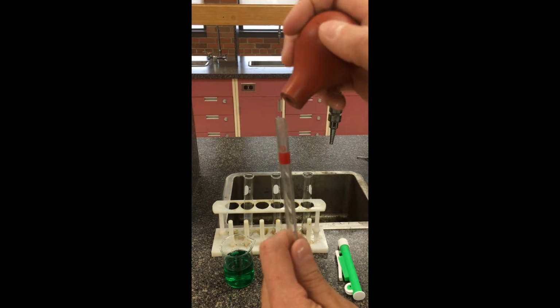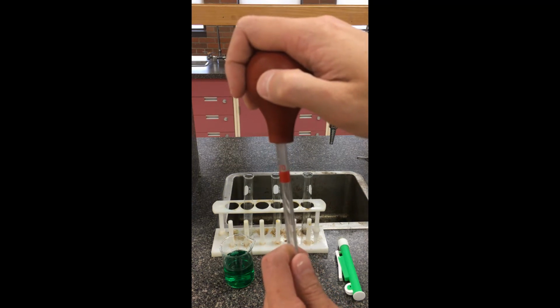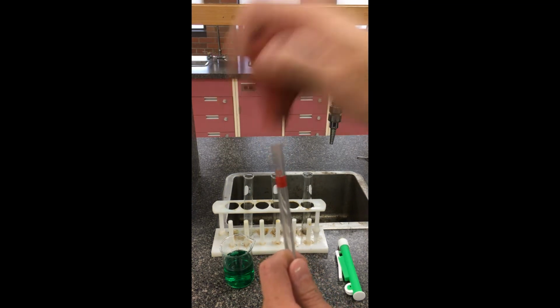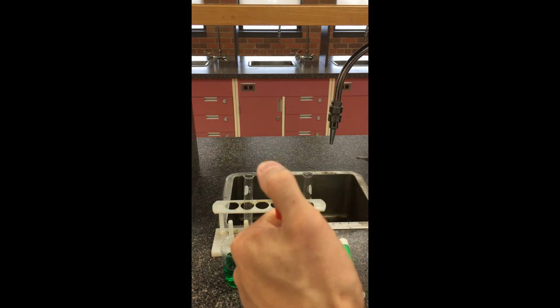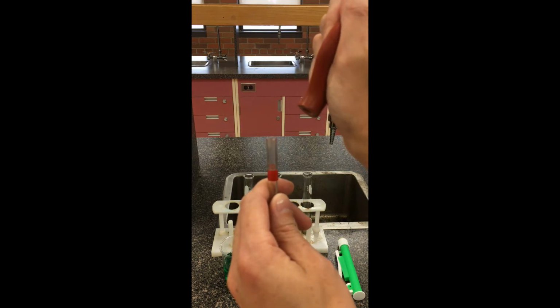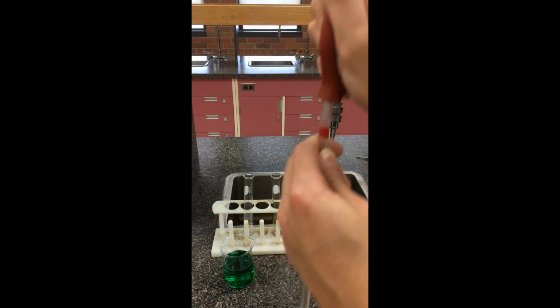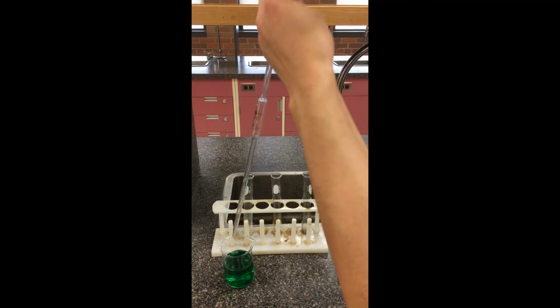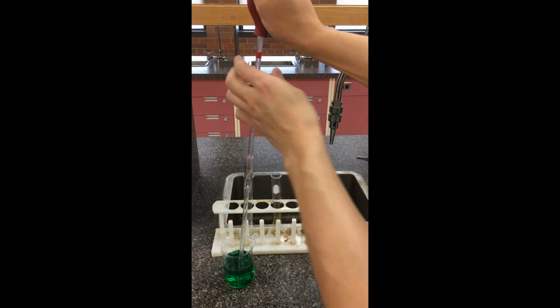We're going to make a little bit of a seal. You don't want to jam it too tightly because, as you'll see later, I need to pull it off and then put my finger on top as quickly as I can to hold that seal. As I'm ready, I'm going to give the bulb a squeeze first, give it that negative pressure, and form a little bit of suction. I'm going to hold the open end open through a beaker. This is just food color water so you can see a little better.